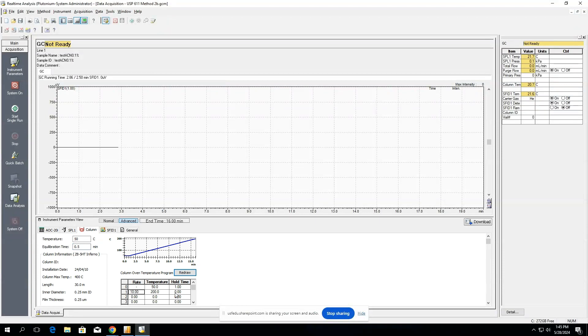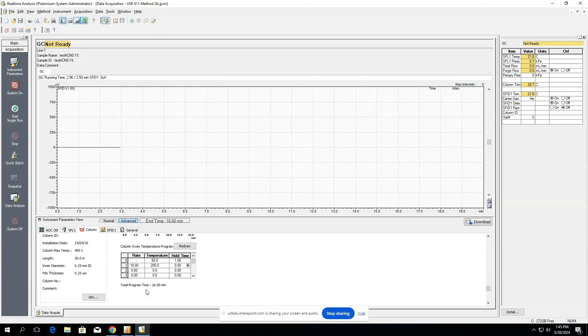If you don't set a value here, it's just going to hold it indefinitely, but it just depends on what you're looking for in your method, and it will give an example of how long each injection will take.